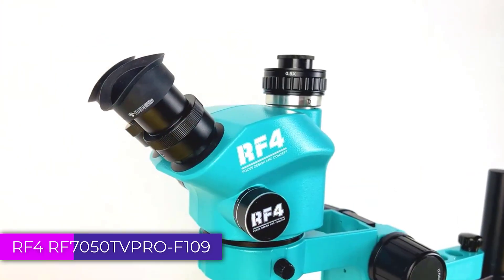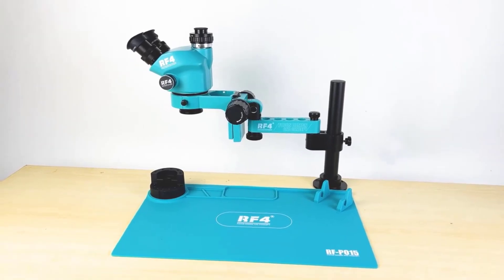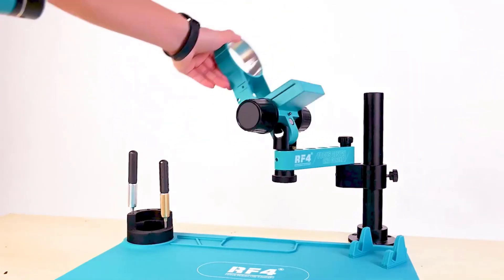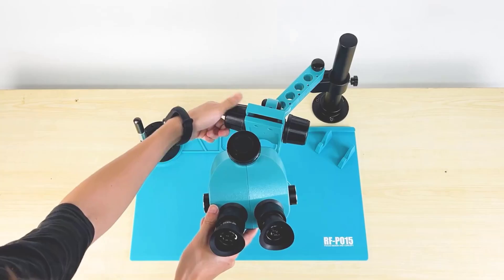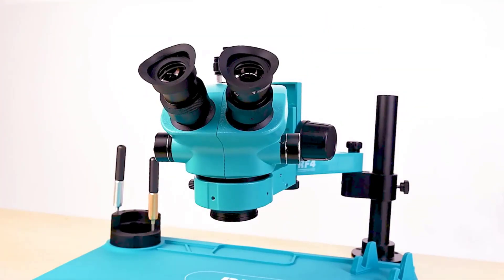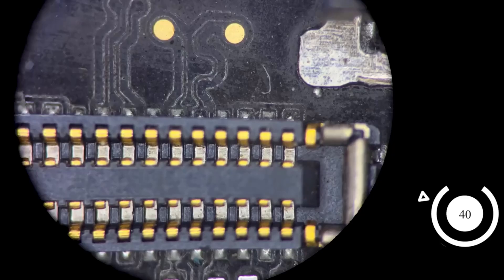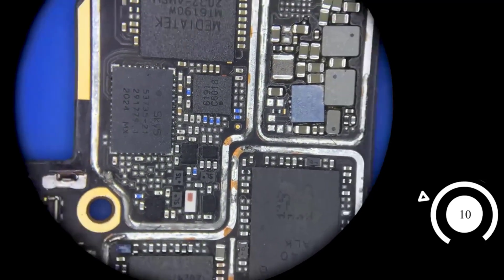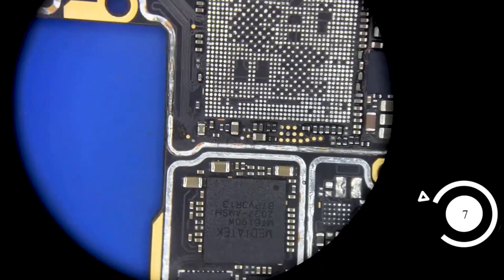Number 1. RF4-RF7050TVPROF109 Stereo Trinocular Microscope. The RF4-RF7050TVPROF109 is a versatile and well-crafted tool that caters to professionals and hobbyists who demand precision and clarity in their work. With its robust build and thoughtful design, this microscope offers a high level of functionality and user comfort. Its combination of accurate magnification control, ergonomic design, and high-definition optics makes it an excellent choice for users who need a versatile and durable microscope, whether for professional use in a laboratory or detailed work in the field.